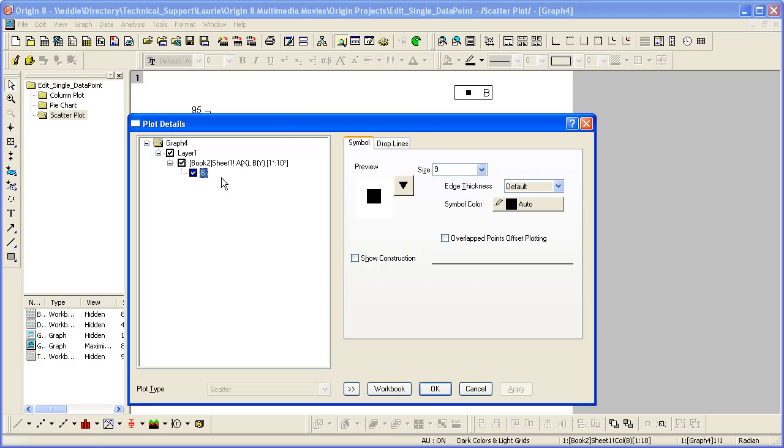In the left panel graph hierarchy, you'll see the row index of the data point that I double clicked on. It appears under the name of the associated data plot.